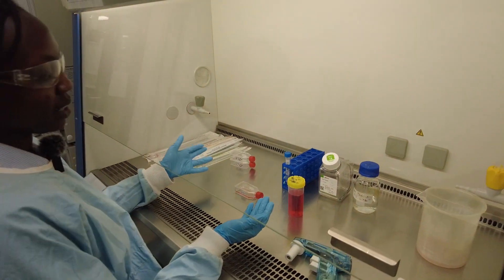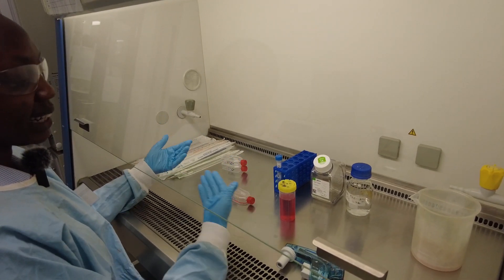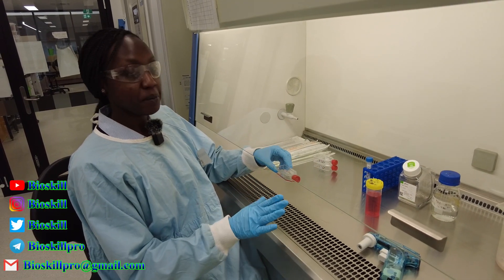So now we're going to remove this old media, wash it, put trypsin which will lift the cells, then leave it in the incubator for about 5 to 10 minutes. But before that, let's have a look at the cells under the microscope.